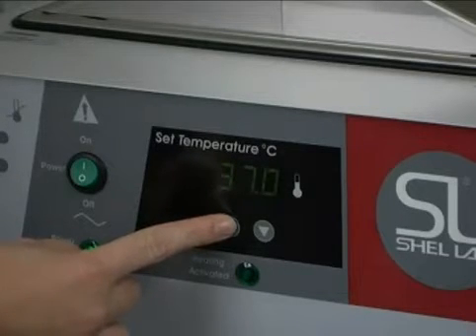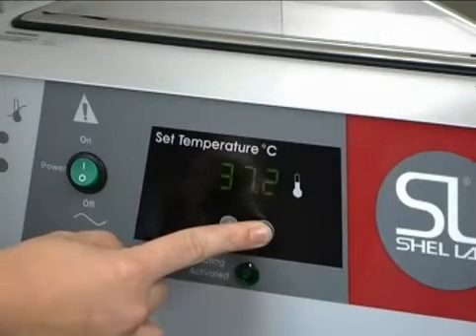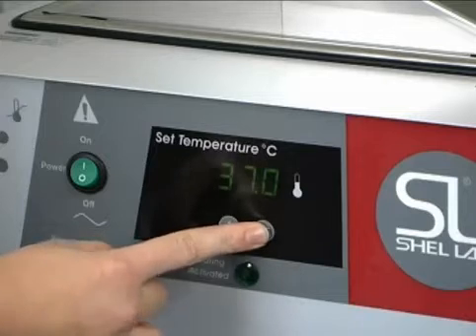While the lights are still flashing, use the up or down arrow key to set the desired temperature. After three seconds, the set point will stop flashing and the bath will resume normal operation and adjust to the new set point.